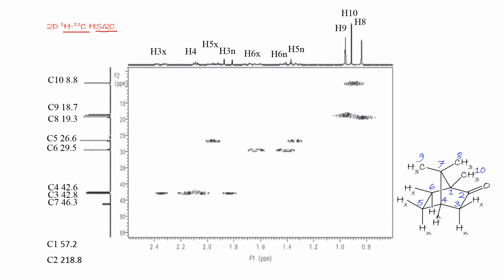So for the CH3 on position 8, here it correlates to carbon 8 at 19.3. For the CH3, or we call it H10, it correlates to carbon 10 at 8.8.